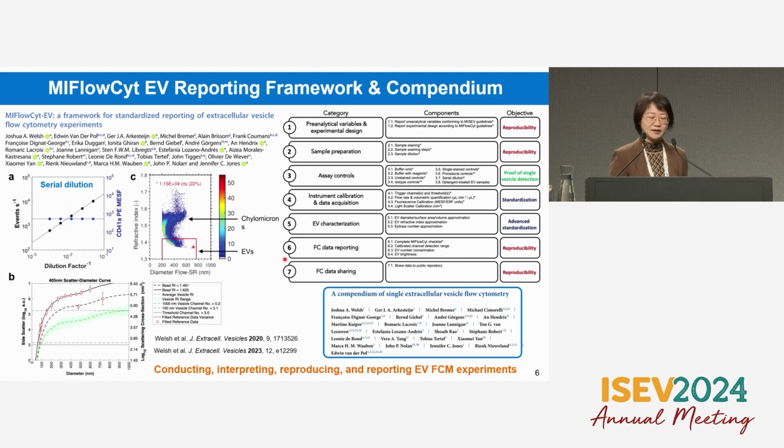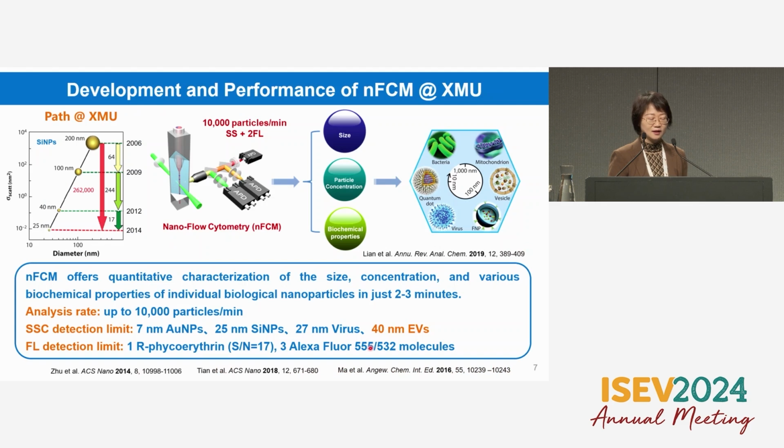I'm very glad that there are two articles authored by the EV FCM working group, and they have been published in JEV, providing background information and detailed guidelines for conducting, interpreting, reproducing, and also reporting EV FCM experiments. Today, I will mainly focus on the development of high-sensitivity flow cytometry.